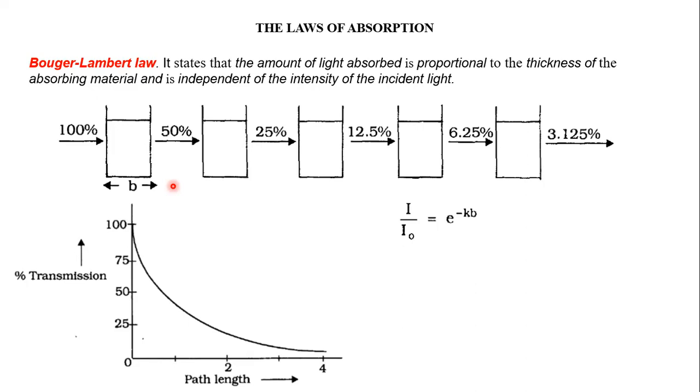And now imagine that you are seeing it passing through a single gelatin sheet, right? So you will see bright red, right? However, imagine that in place of a single gelatin sheet of the red color, I am putting say two gelatin sheets. What will happen? What will you see coming out?